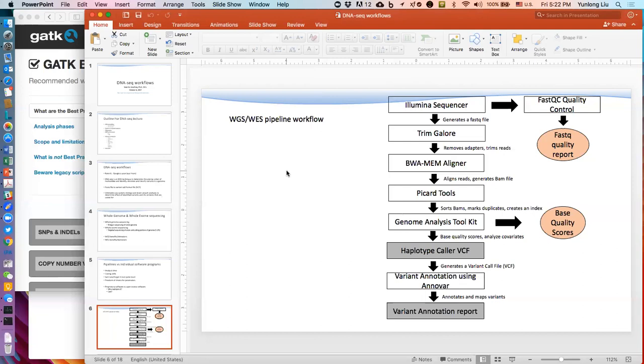That is where your VCF file comes from, your GATK. The haplotype caller, some people use this, some people don't. It's questionable. You've heard a lot about haplotype, and it's been a large part of NGS for years. Haplotype calling and base calling, it's a very important step in actually making sure that your genome is correct.